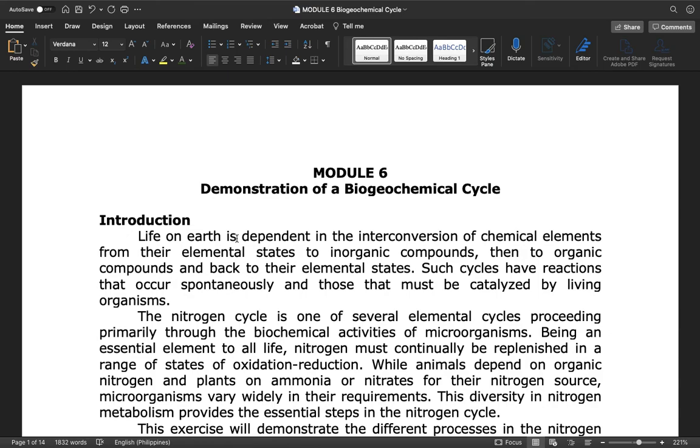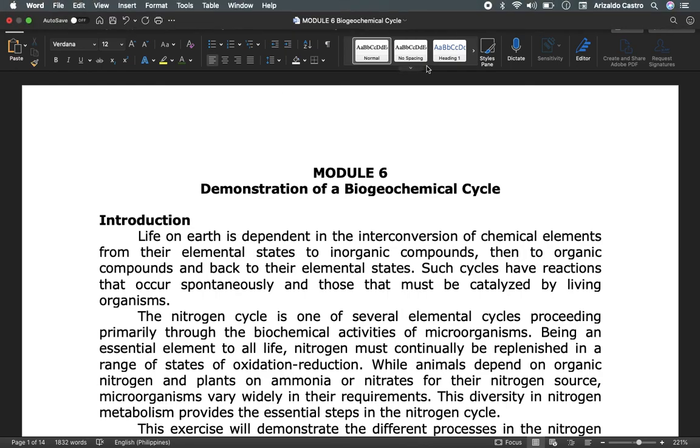Because may part doon na magko-compute kayo, mag-implement kayo ng pipeline, yung Mothur pipeline natin sa Galaxy. I'll give you another set of sample data, and then there are associated questions. That's why I'm giving you 72 hours to complete that exam, because it will take time for your machines to compute. Diba? Okay, so that ends our first recorded session.